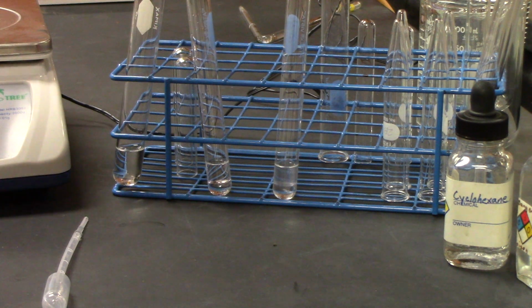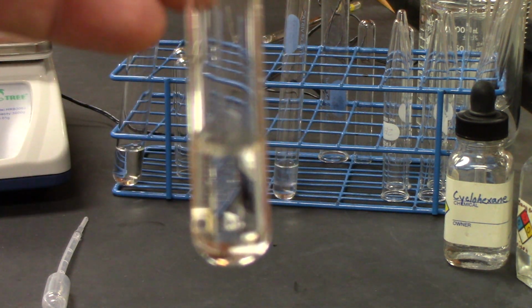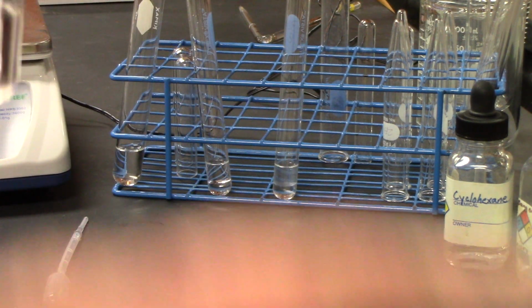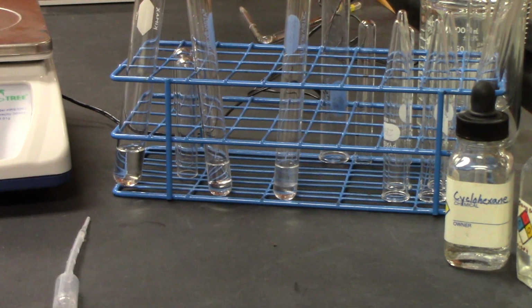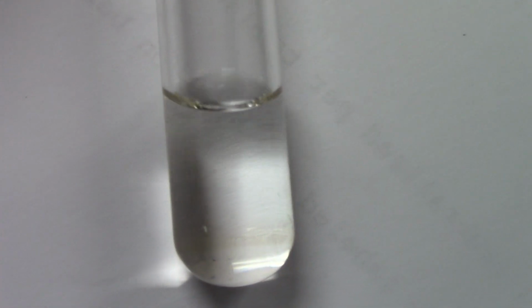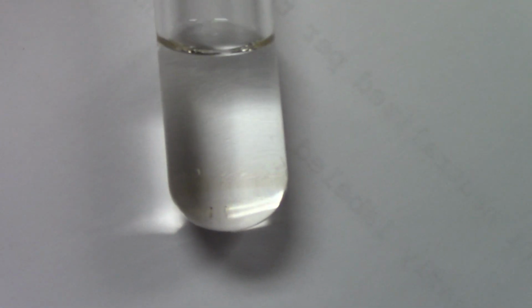All right, my second one is the cyclohexane. And so if we look closely, see if I can get a good background here. Okay, if you can see, there's no separation. Okay, that's just a glare from the light from above. But it looks like my unknown is completely soluble in the cyclohexane.